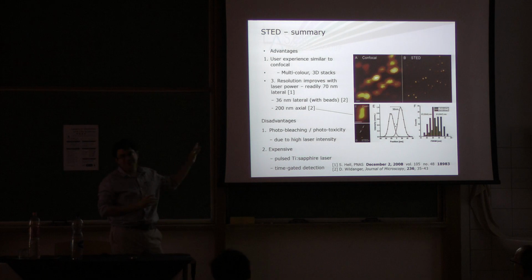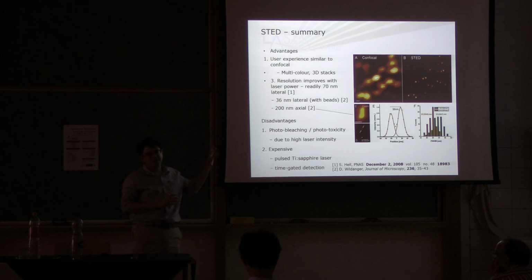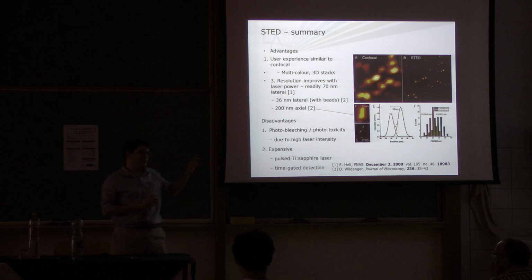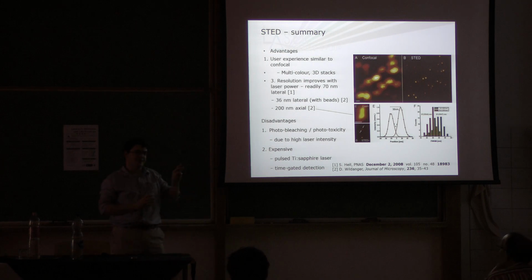So you need some sort of essentially indestructible calibration sample. So you have some gold beads, and what you can actually do is cheat and look in a reflected light mode. You can focus it with the normal laser, and then with your depletion laser, which should be a perfectly circular aligned donut shape, you can switch to just that laser and check in the right detection mode that you get the correct shaped circles.